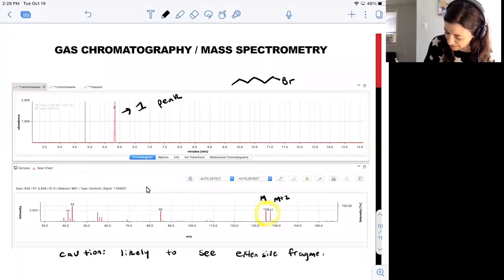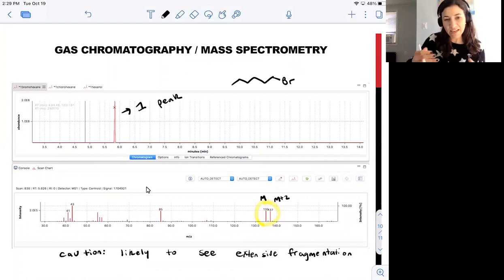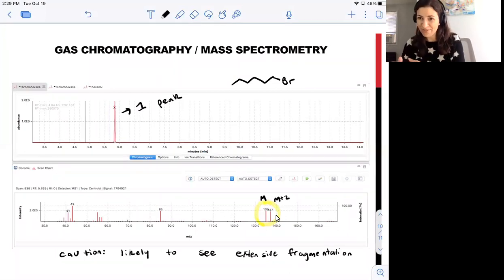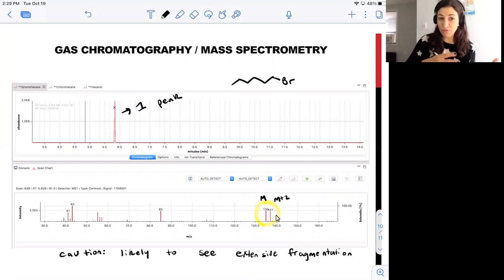So for instance, if you were to obtain GCMS data for your product and it were to look exactly like this, you would be able to say with high confidence, based on matching the retention time to this reference bromohexane that I've shown you, and also by looking at the mass data and confirming the presence of a bromine, you would be able to say with high confidence that you had made 100% of the brominated product.